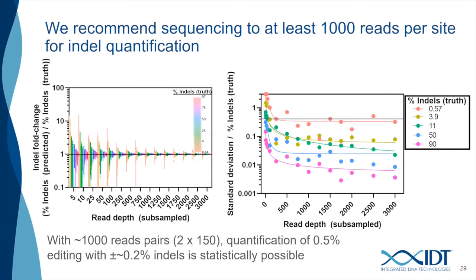On the left, we can see the magnitude of indel fold changes decreases as you put greater read depth on.